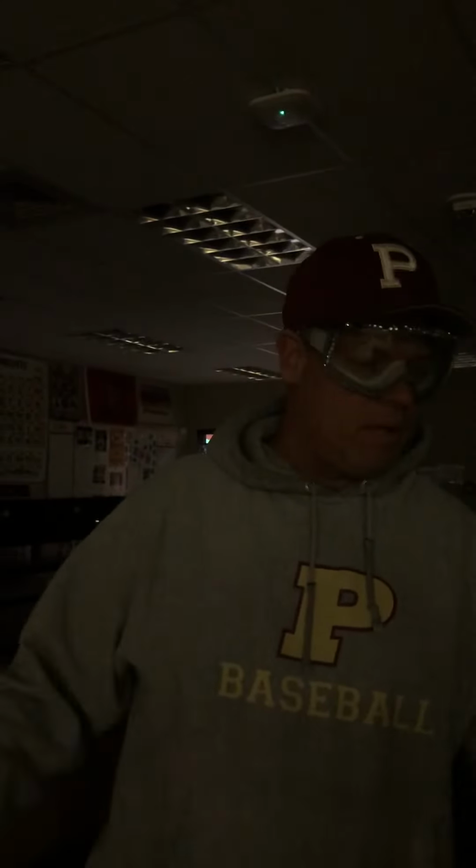on the spectroscope. So what we're going to do now, okay, is I'm not going to tell you what I'm going to put in the flame, because remember, the color is a characteristic property. So based on what you've just done, I am going to put a substance in the flame, and you have to identify what that substance is based on its color. Okay?